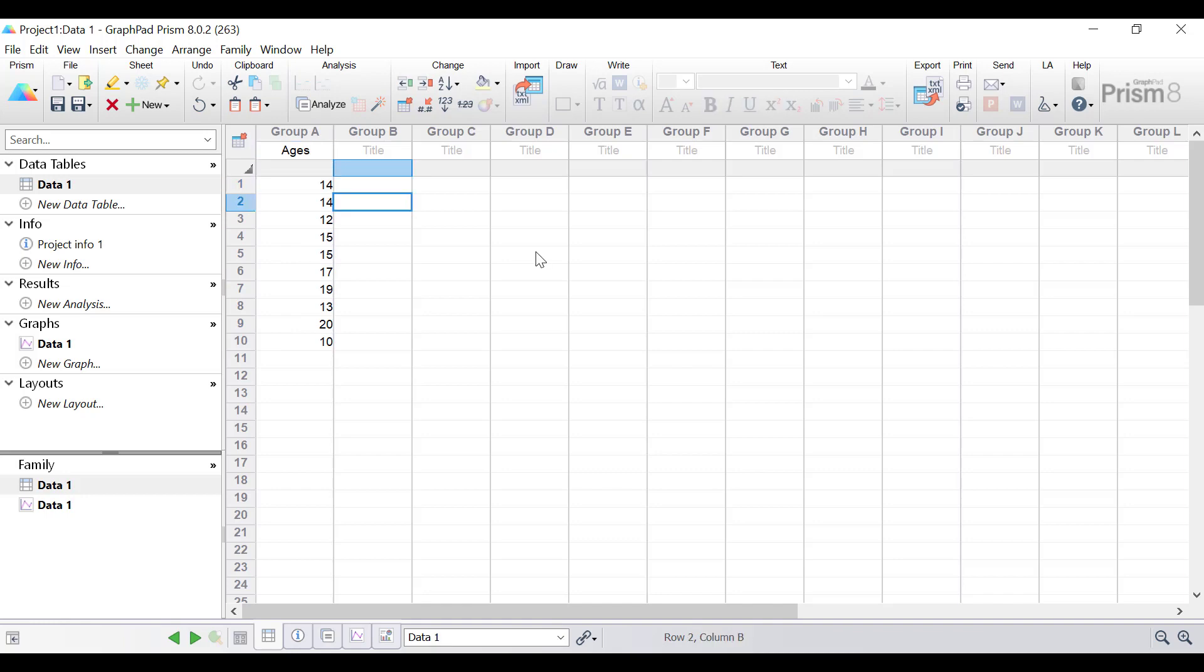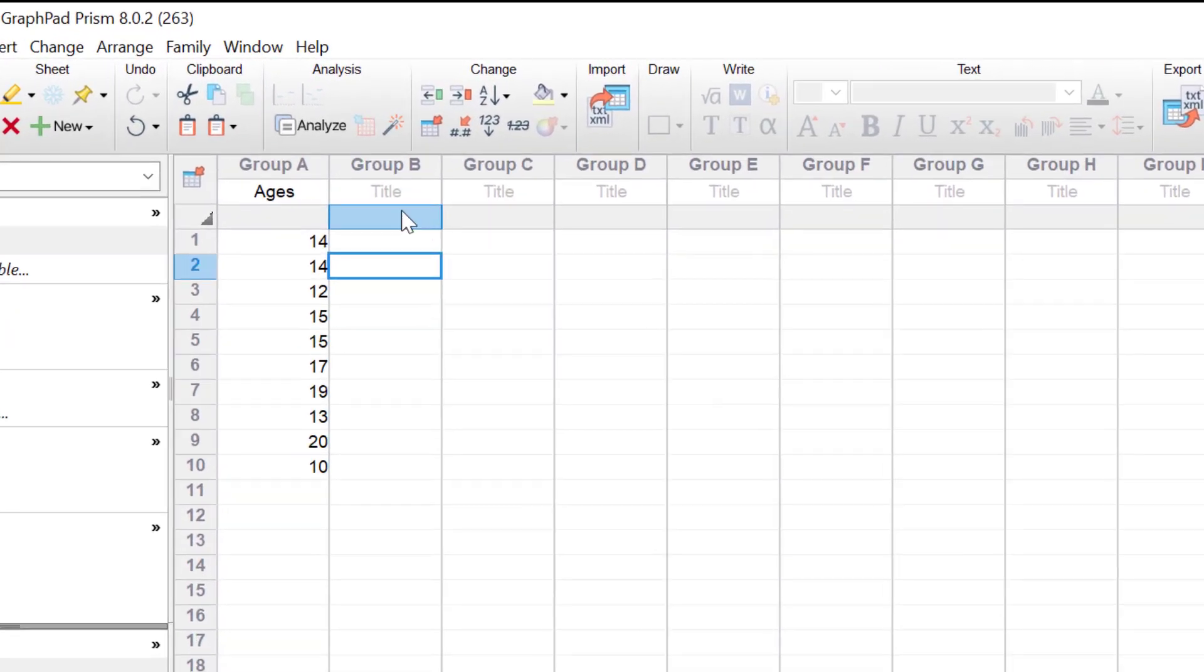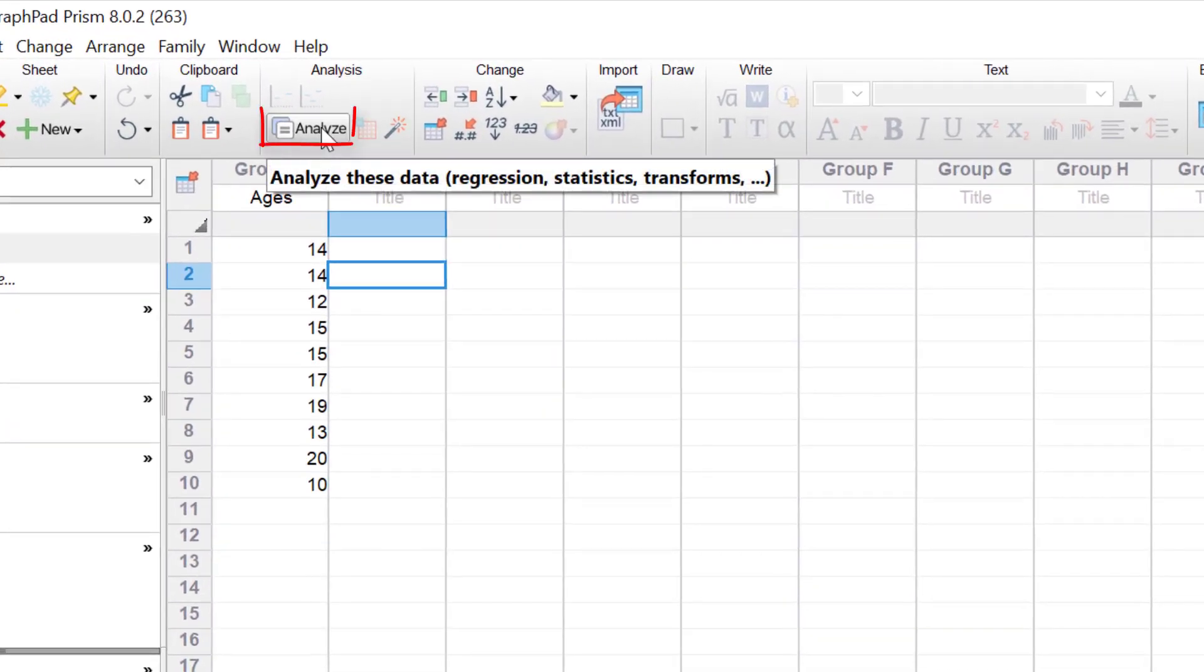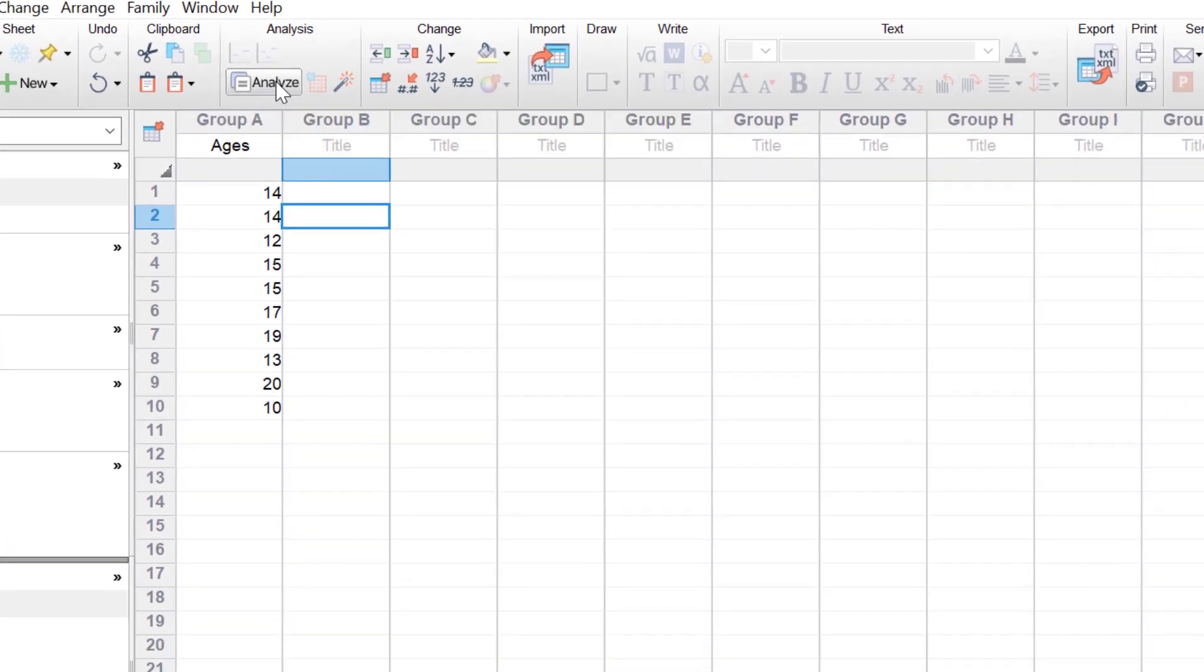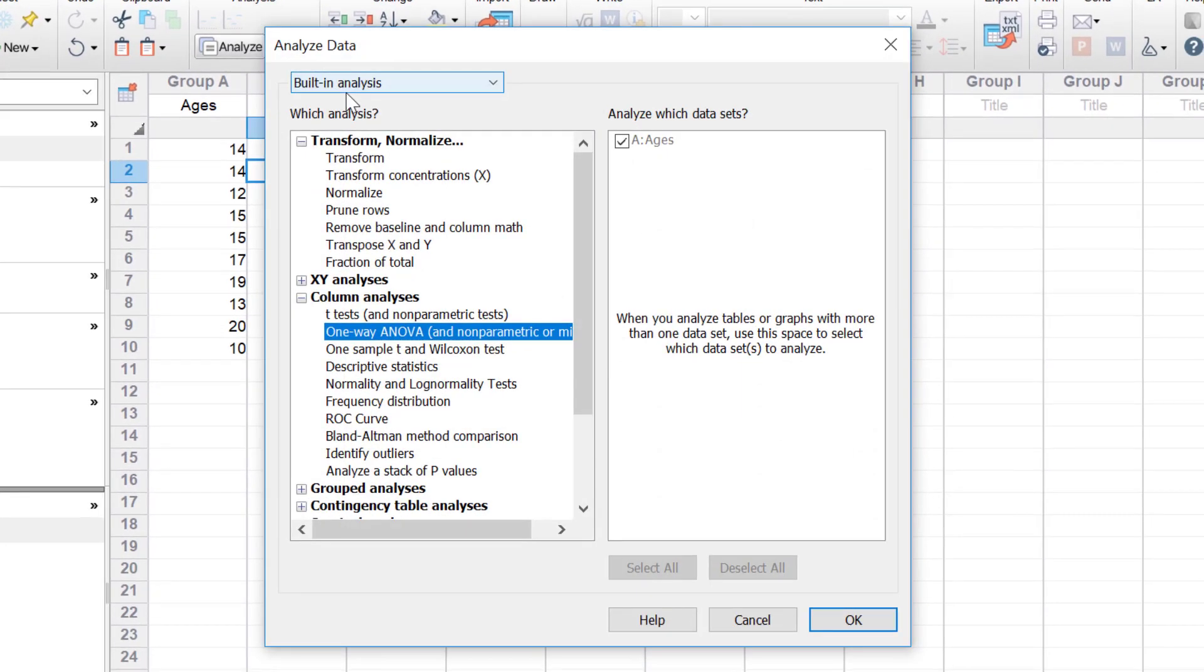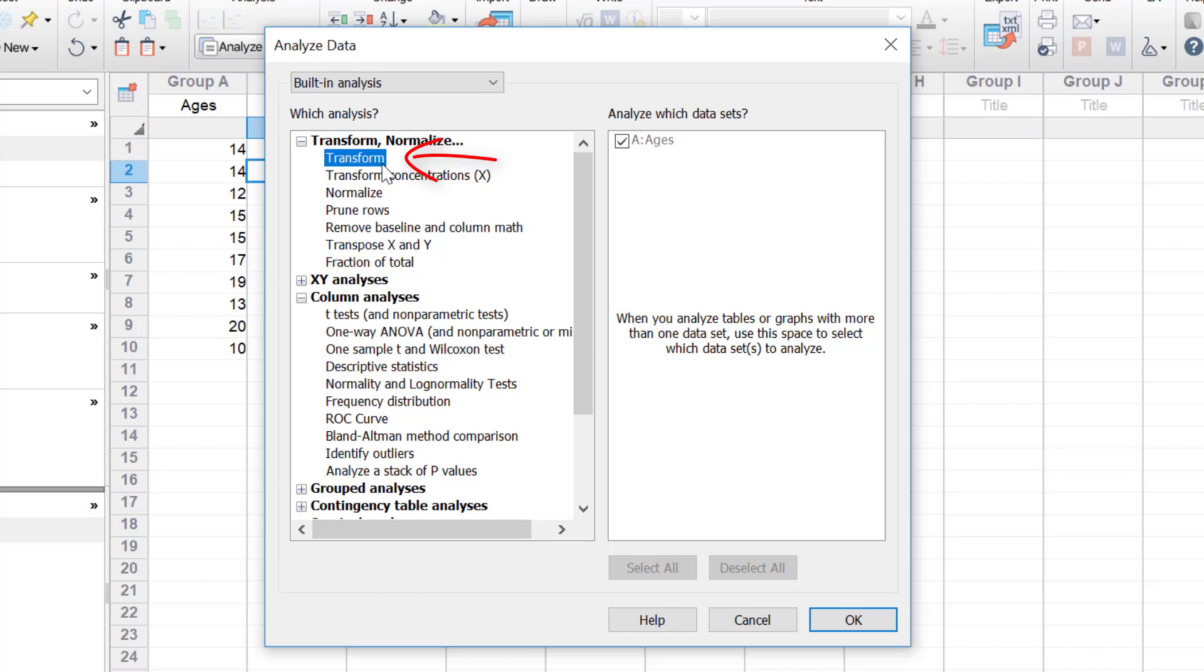To log transform data in GraphPad, go to the analyze button and then under transform normalize click the transform option.